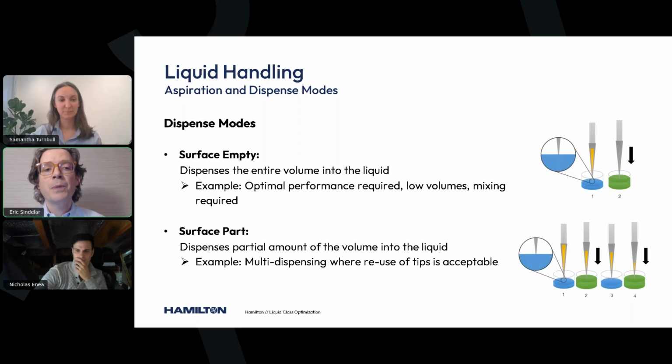Then the final mode, surface part, is when you're dispensing a part amount of the total volume of liquid into the well, but dispensing it directly into liquid. So this is used in the rare examples where you might be multi-dispensing, where reuse of the tips is acceptable.